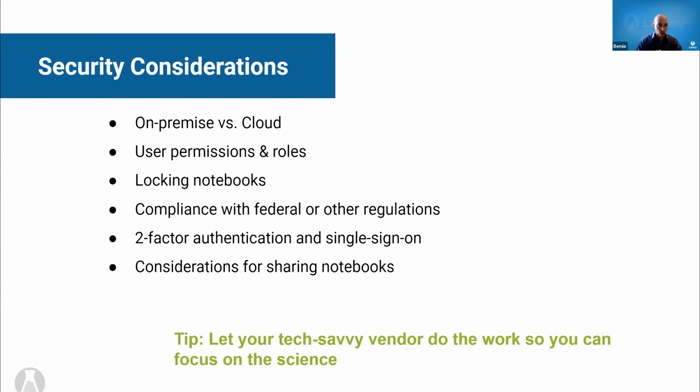This is actually where I'm going to add one more quick pro tip, which is quality vendors, quality software development must emphasize security in their processes, in their software development, or trust in them would rather quickly be lost as security breaches would pile up. So you can ask these vendors about their approaches, but most, frankly, are quite good at this. And so when you can, let them do your security work for you. Use their secure infrastructure if you can. I know lots of people can't, but if you can, it's a good deal.